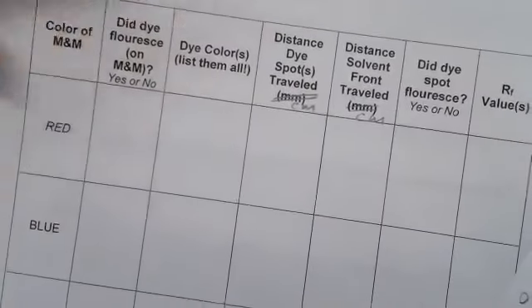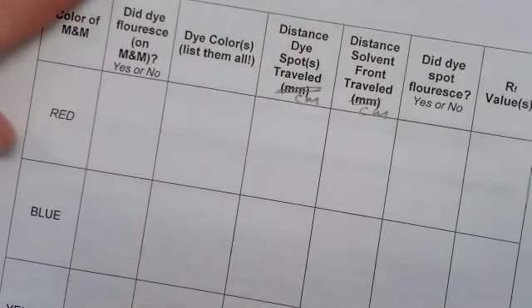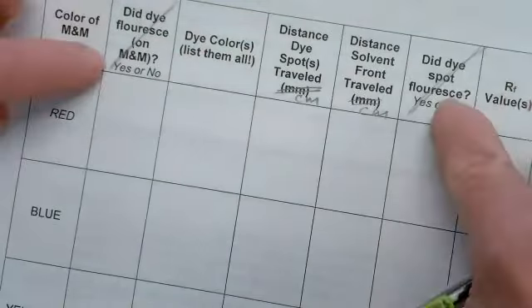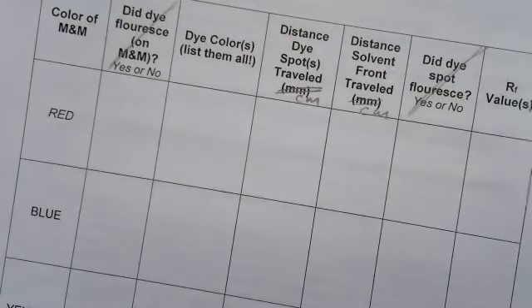Food dyes actually glow when exposed to ultraviolet light or black light. However, we need to not have any visible light. I love our windows. Our old classroom made this very easy. I'm figuring it out. So for today, you're not responsible for measuring fluorescence. So we can leave the first column and the next to the last column blank. Okay, we will do that for all of the M&M samples.